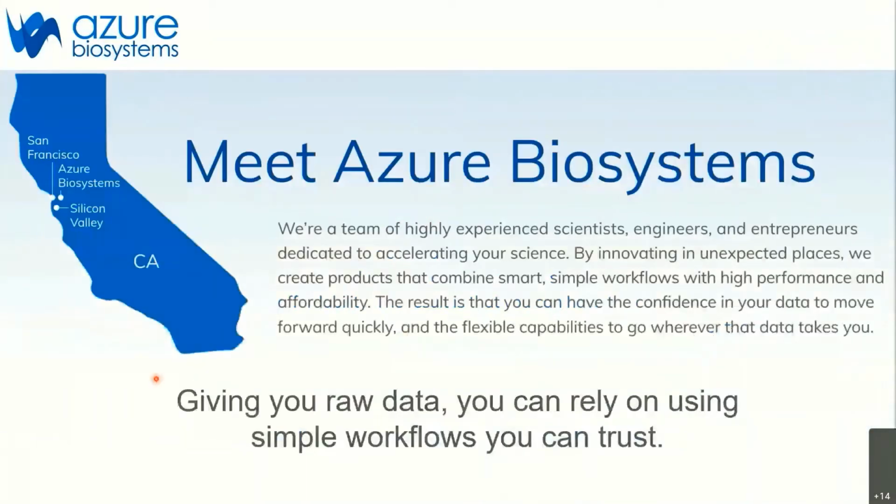Right, first, let me introduce Azure Biosystems to you. We are a United States-based company in Silicon Valley, or near Silicon Valley, in California. We are a team of highly experienced scientists, engineers, and entrepreneurs dedicated to accelerating your science. By innovating in unexpected places, we create products that combine smart, simple workflows with high performance and affordability.